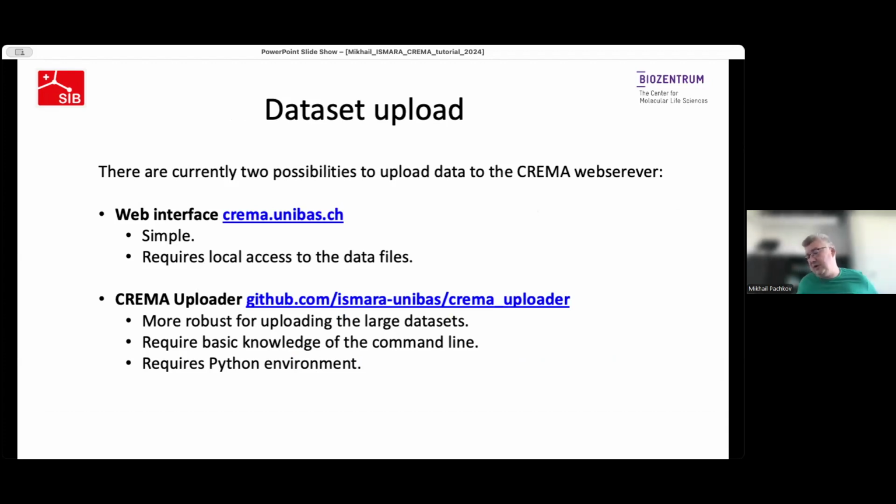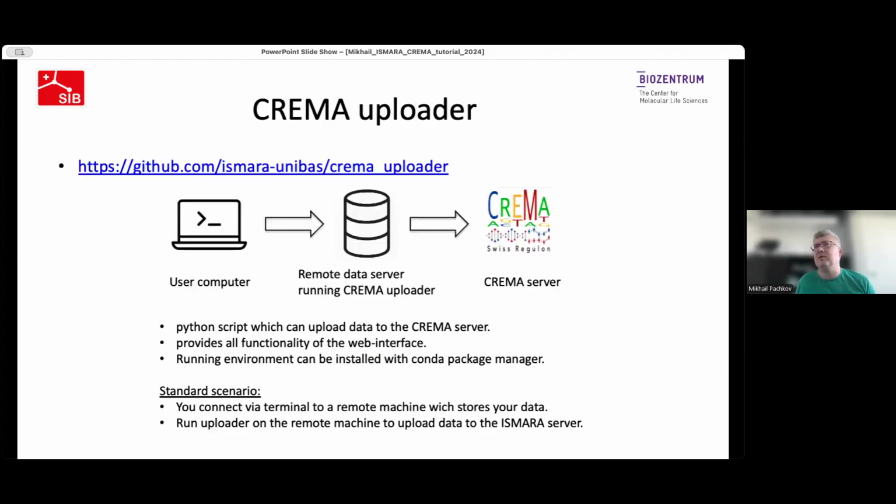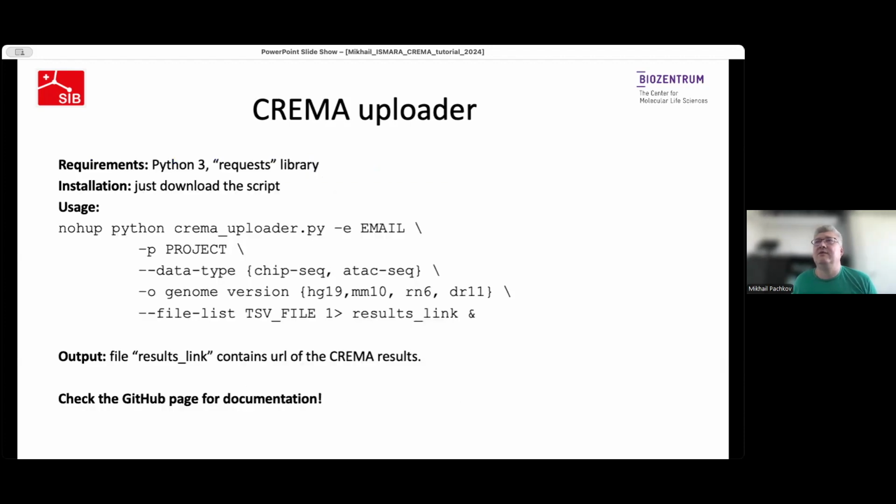So you just use the script to run it from the command line on the remote machine, exactly the same way as was shown before for ISMARA. Basically, it has exactly the same software requirements to be pre-installed. You just need Python and a couple of libraries, and that's all. And of course, all details you can find on the GitHub page.